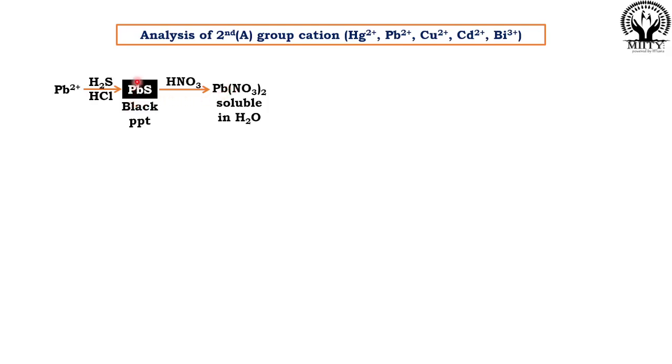And here a redox reaction takes place. Sulfide will be oxidized to sulfur, and nitrate ion will be reduced to NO.